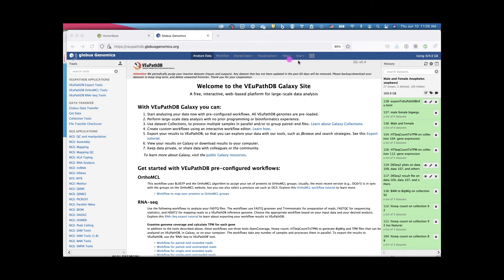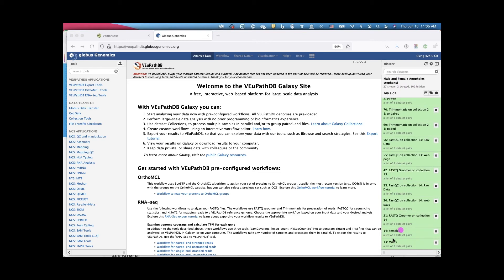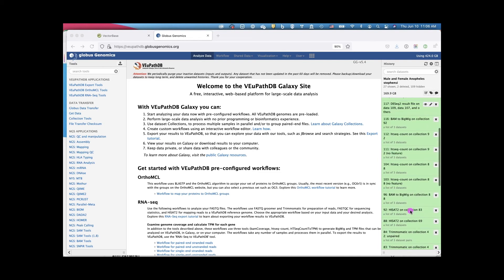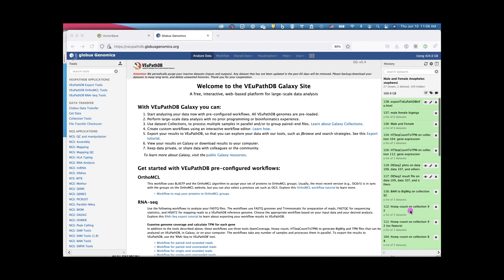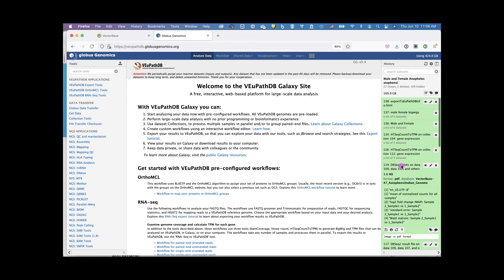As Gloria showed, she ran an RNA-seq analysis. I have one here as well — comparing male and female, so obviously it's still quite differentiated. It's a very simple two-condition comparison. Going through as Katrin and Gloria showed, we have all these different steps and then the DESeq2 steps at the end, which include the information about your differential expression. There are two key files: one is a PDF of 3.6 megabytes that shows you information about your differential expression and how good and robust your differential expression is — that could take an entire webinar to go through. The second DESeq2 output is a tabular file.